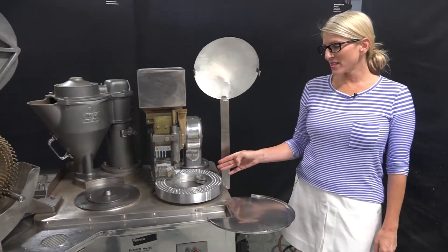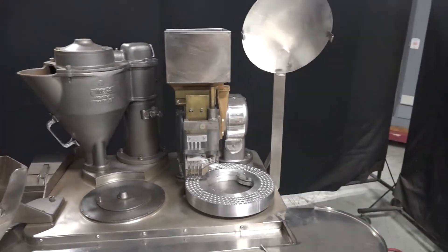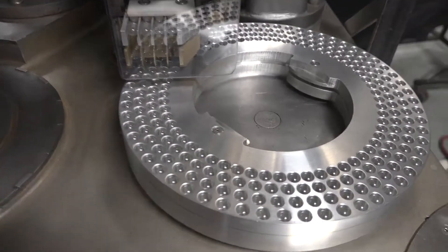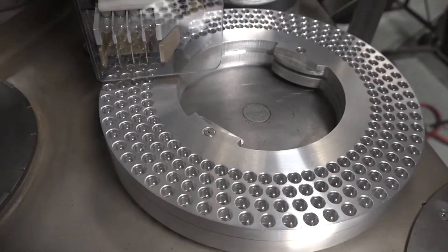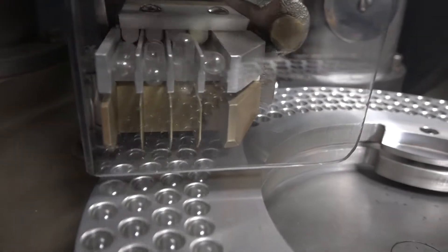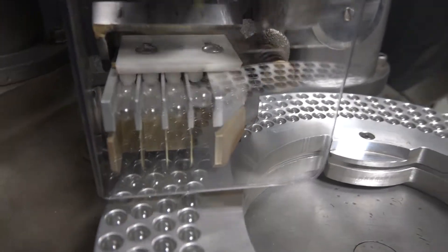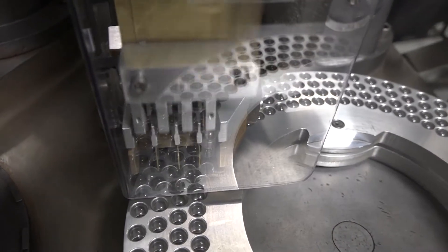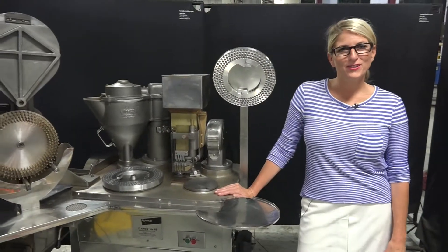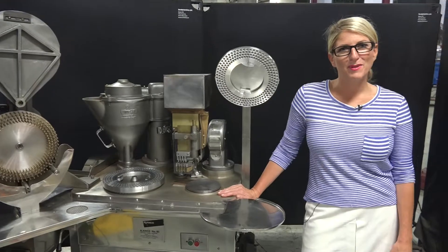In this first section, empty capsules are sorted and loaded into this tray. After the trays are loaded, the two halves of the capsules are separated so one half can be filled.